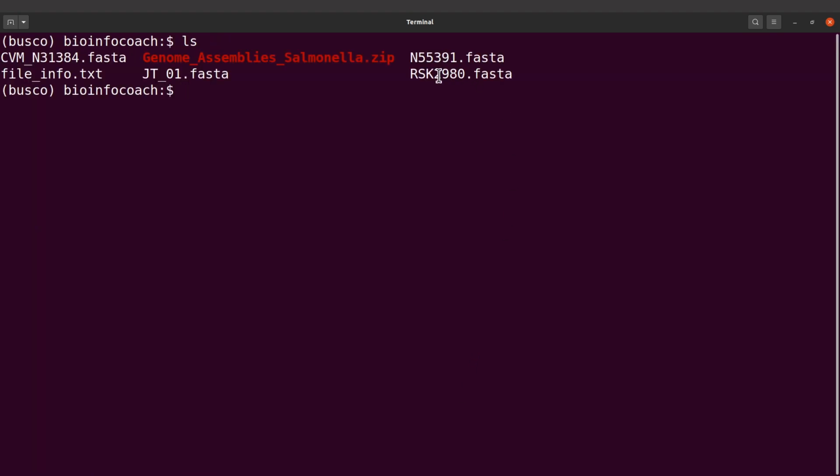So that's it. Now let's do this. I have my FASTA files, 4 of them. That means 4 samples in this context. So what I'll do is create another directory and then move these files into that directory. So I'll say make that, and I'll say genomes. Let me just do it again.